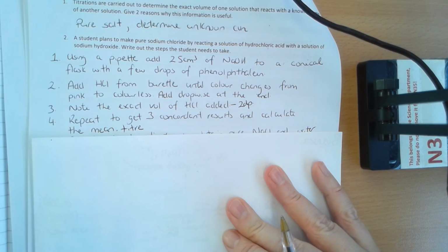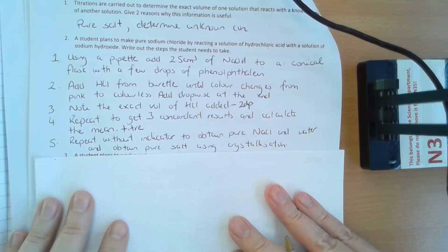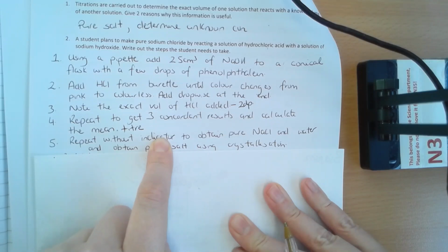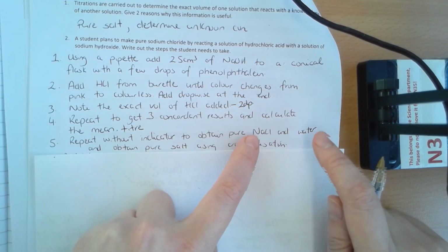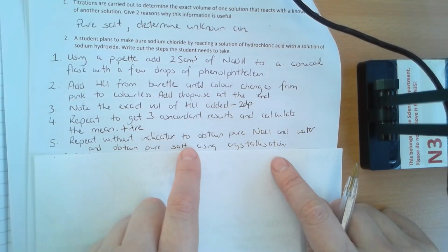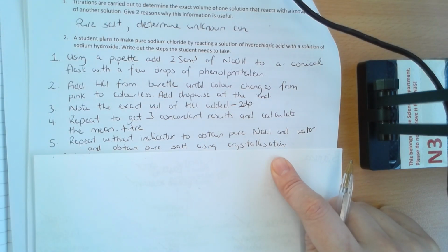You don't need the indicator anymore. You know when the color change is going to take place. So then you're going to repeat it again without the indicator. And this means that in the conical flask at the end, you'll have no indicator in there. All you'll have is pure salt and water. Your final step then to obtain that pure salt is to evaporate the water using crystallization.